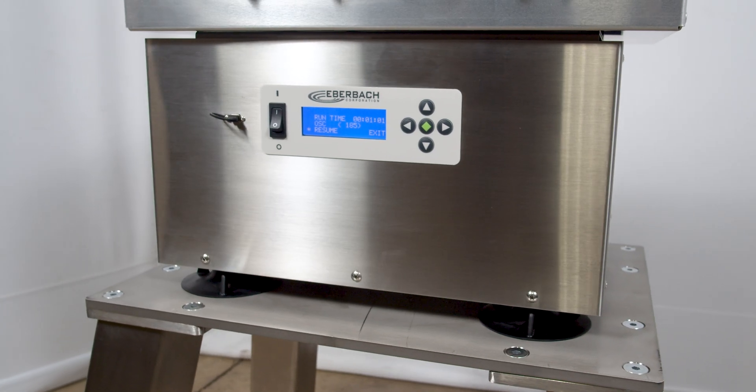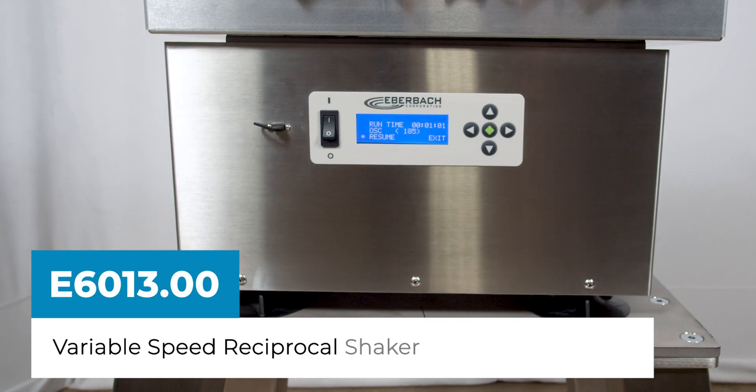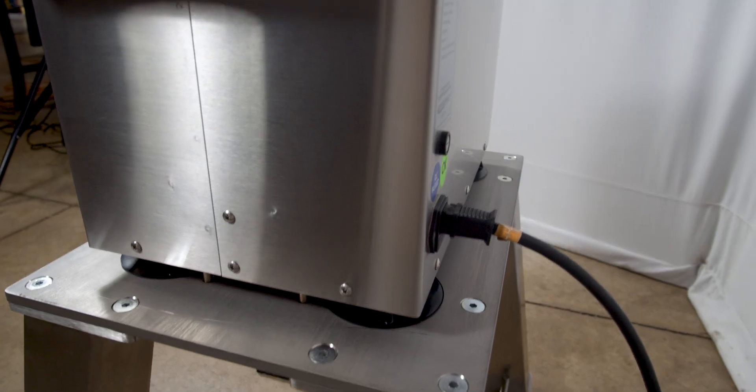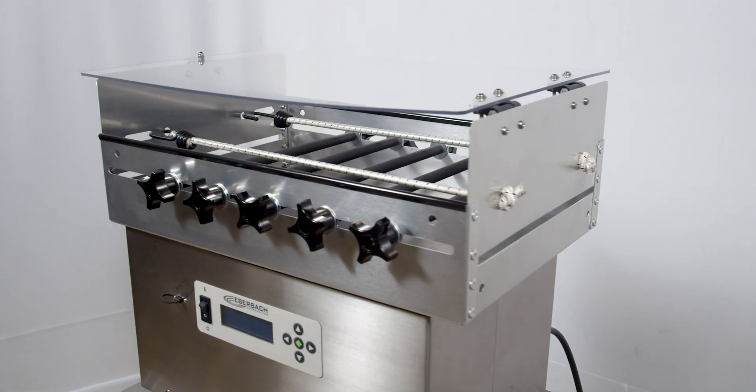Complementing the E6010 series shakers is the E6013 variable speed model, shown here in 316 stainless steel. A host of accessories are available to help better support our customers' needs.